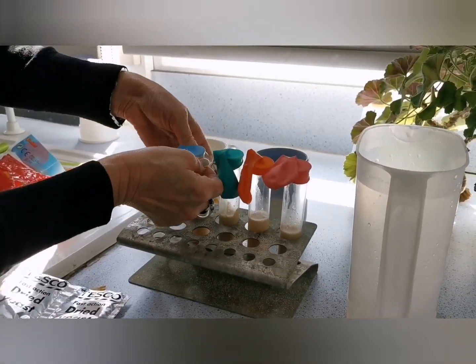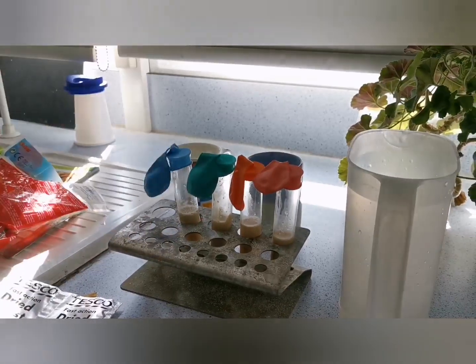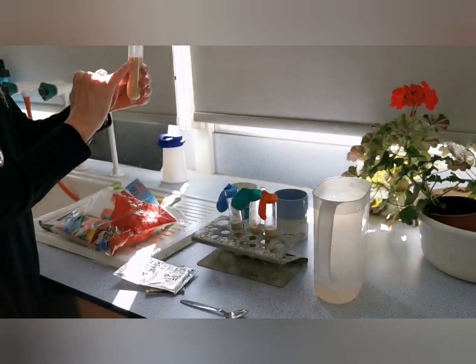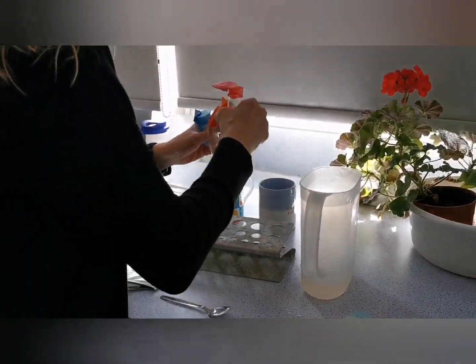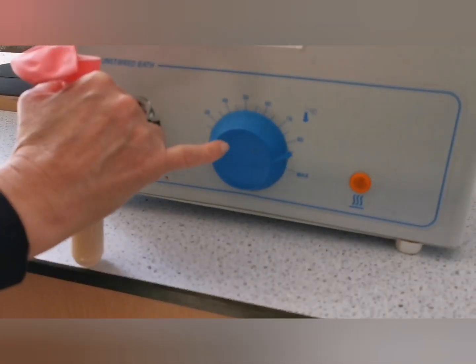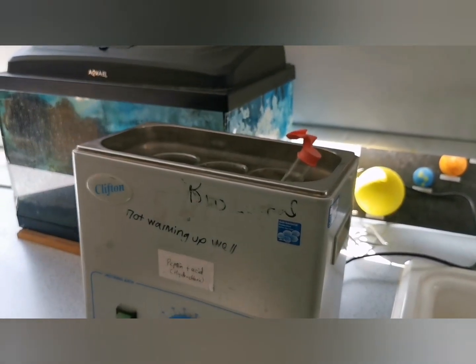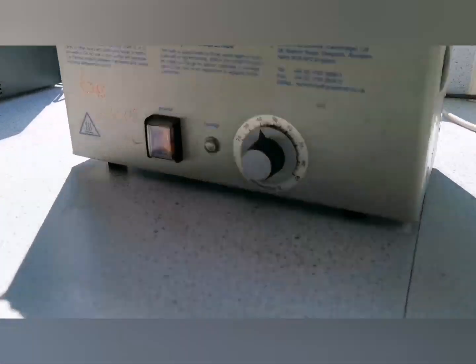So ideally we'd have lots of these at each temperature, so we've got a fairer test and give us more accurate results. So these will start to ferment, they will start to produce carbon dioxide and ethanol. So now what we're going to do, we're going to take these and put them in different water baths of different temperatures. This one here is our hottest. This is at 90 degrees, so almost boiling. In we go.